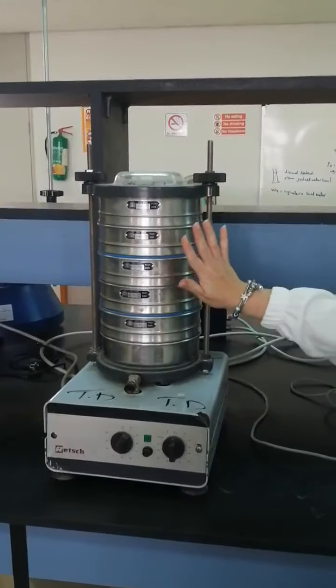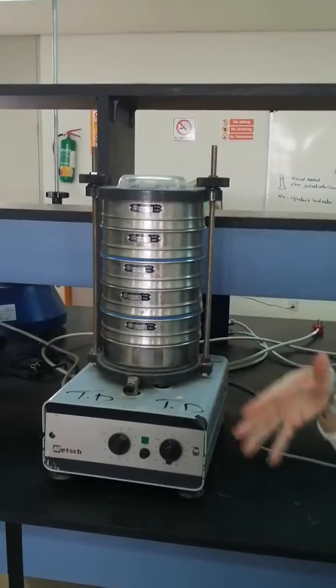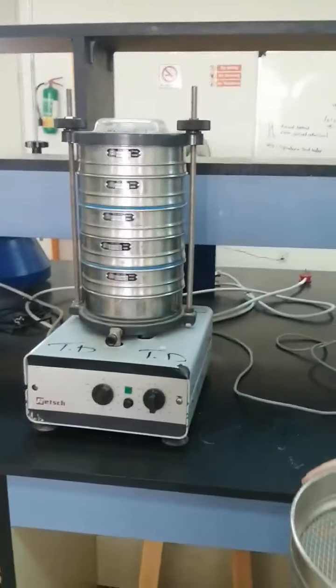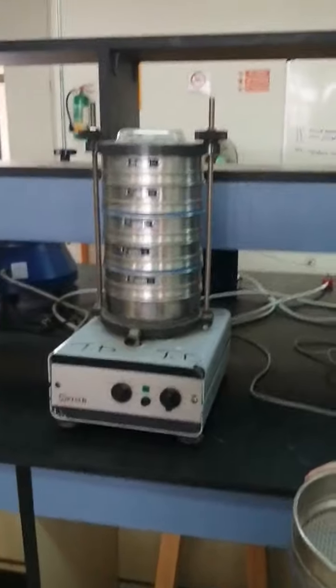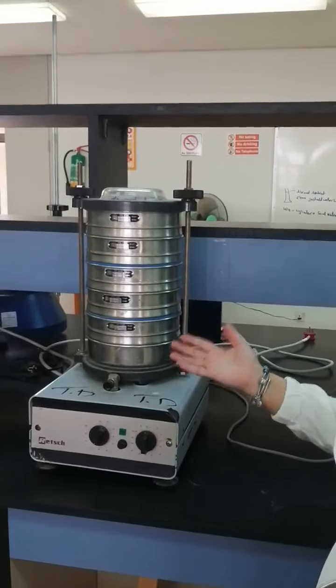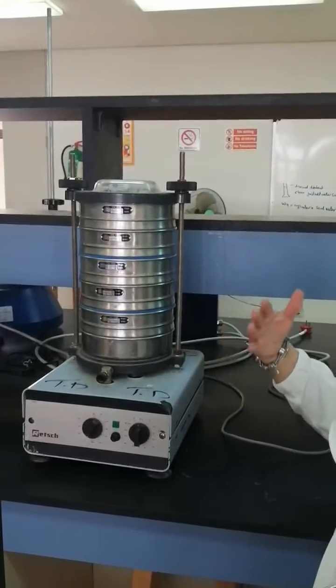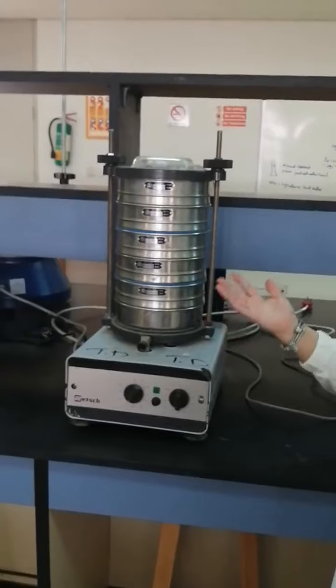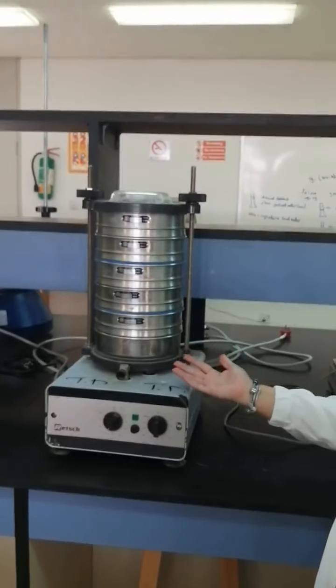After the sieving time, we take each sieve and weigh the powder inside, and we make a drawing of the distribution of that sample to see what is the mean, what is the mode, what is the average size or surface area of our particles.